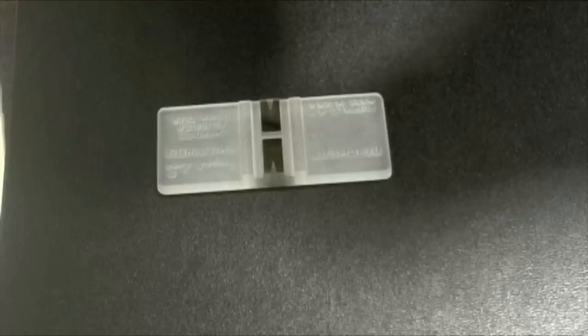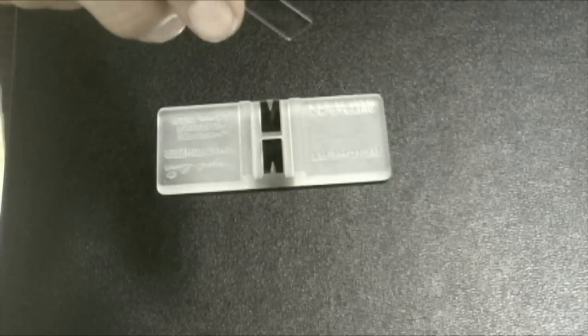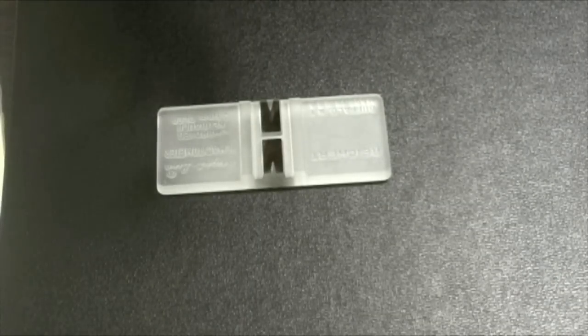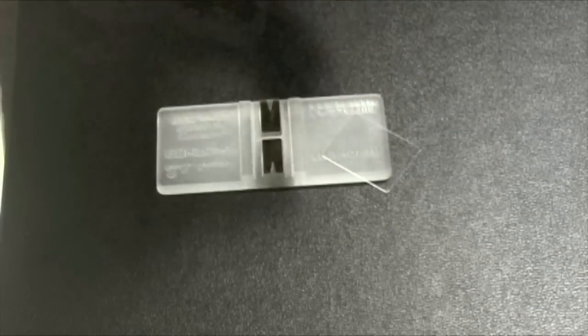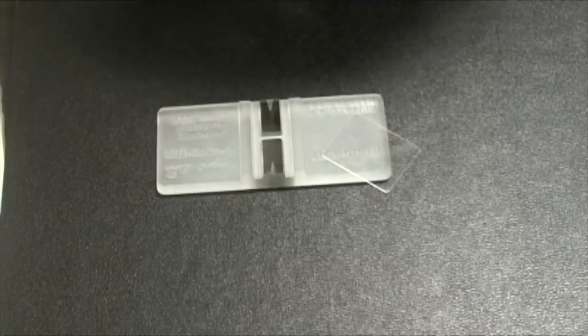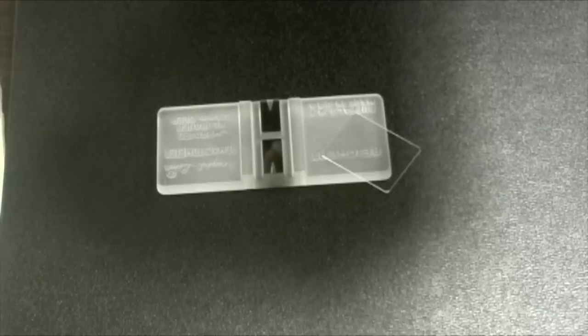So let's set our cover slip here to the side. The cover slip should be nice and clean. Again, everything should be put away clean. But if necessary, you might want to polish it with a Kimwipe to make sure that it's nice and clean. Now, for this demonstration, I'm going to cheat a little bit and use some colored particles to make it easier to see in the video.